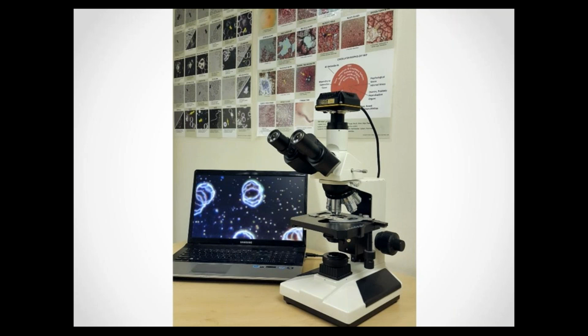In terms of maintenance, that's also with the halogen type of microscopes, with the normal halogen bulb. That's a consumable item. The halogen bulb needs to be replaced fairly regularly as the bulb gets old. It breaks, and then obviously you need to replace it with a new one. Okay, so really not that much maintenance, and they're actually very hardy, aren't they?